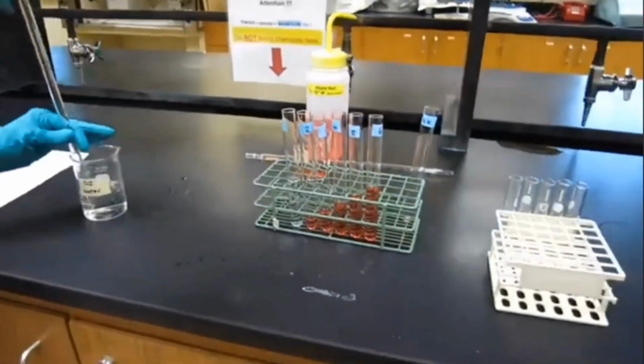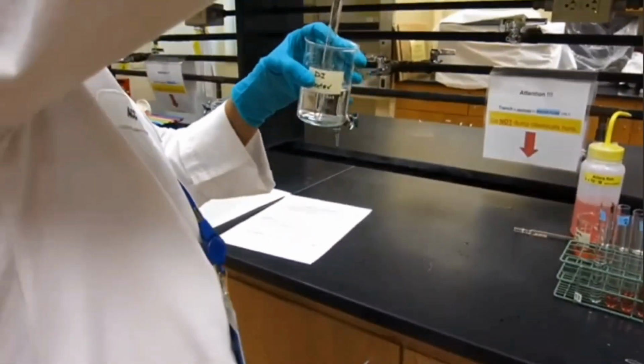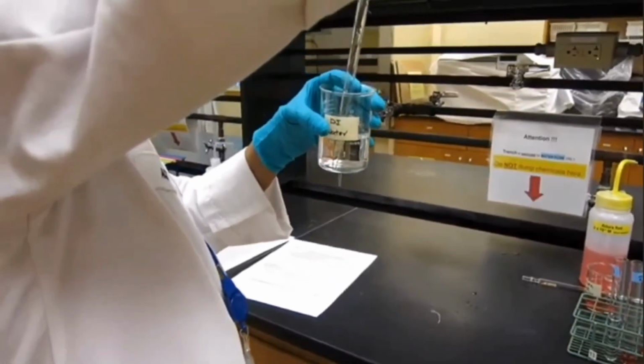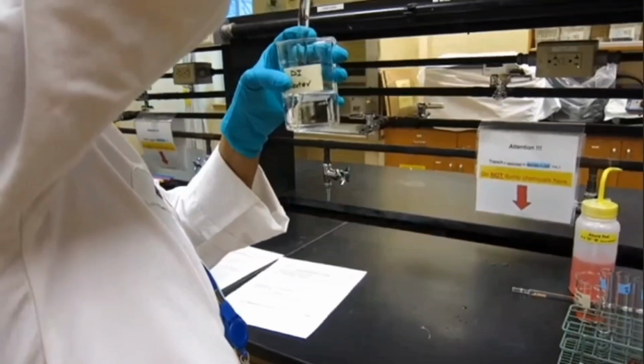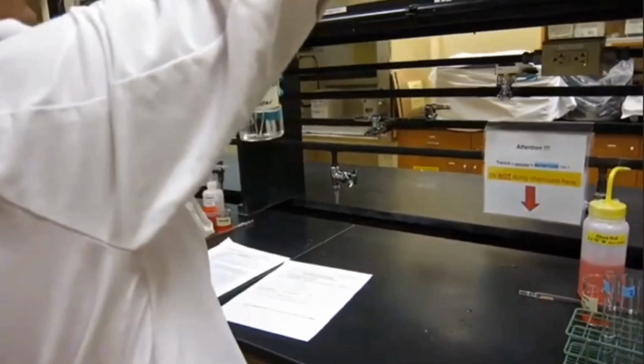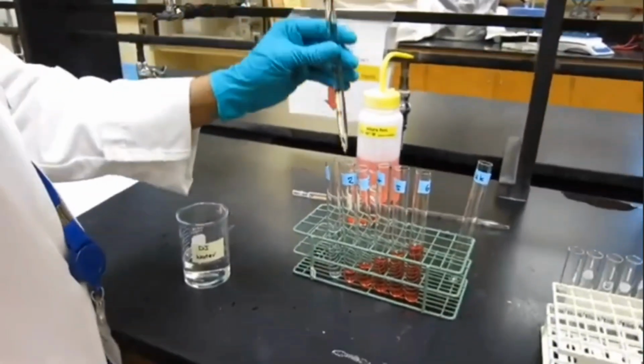So how many milliliters of water do we need for that? It's going to be 8 milliliters. So the second test tube we will be adding 8 milliliters.